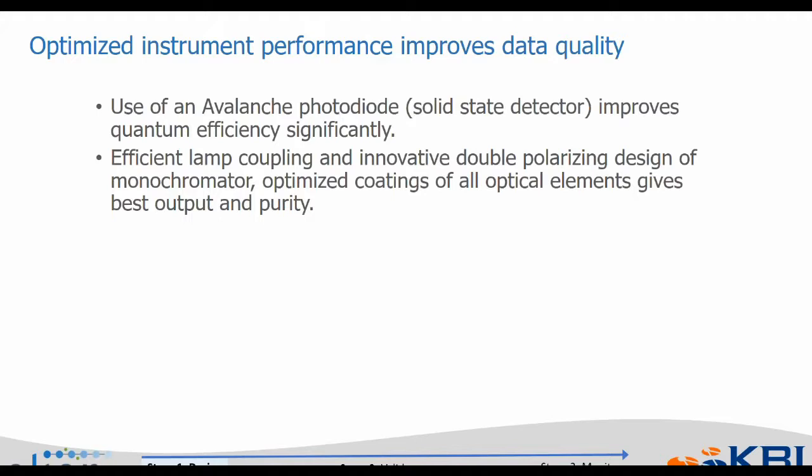I'll move from here to talk about certain design aspects that are important through the first stage of circular dichroism procedure life cycle management. I'll go through these next few slides fairly quickly, but this first one is related to features of the instrument that as analysts we really have little control over.